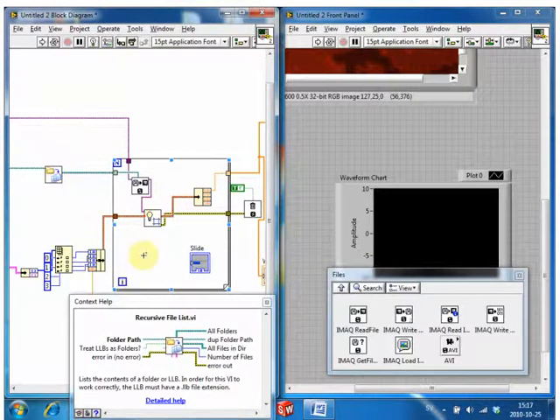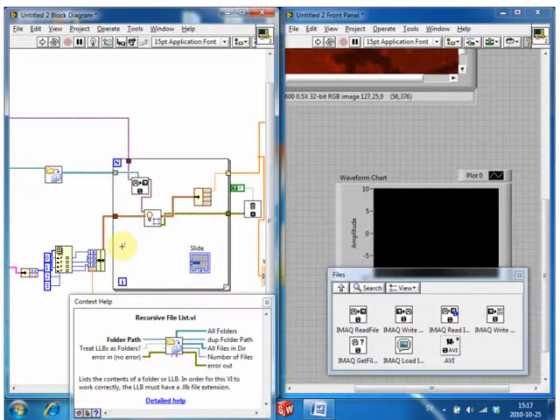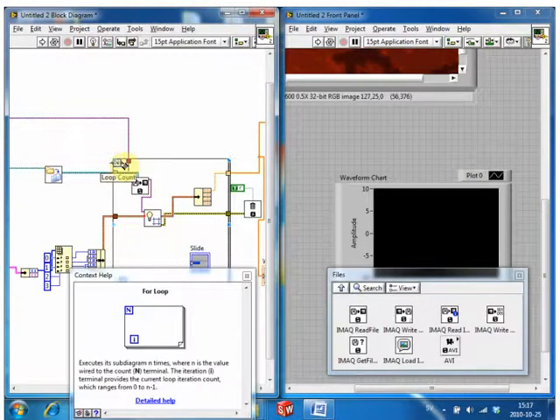Can I also use n for that? Should it be also the number of files, like coming from this little indexing thing? I don't know if it will actually do it. But there is no problem, I guess, if it's a 0, because then the loop will be executed 0 times, and if your operations are inside the loop, they will never be executed.